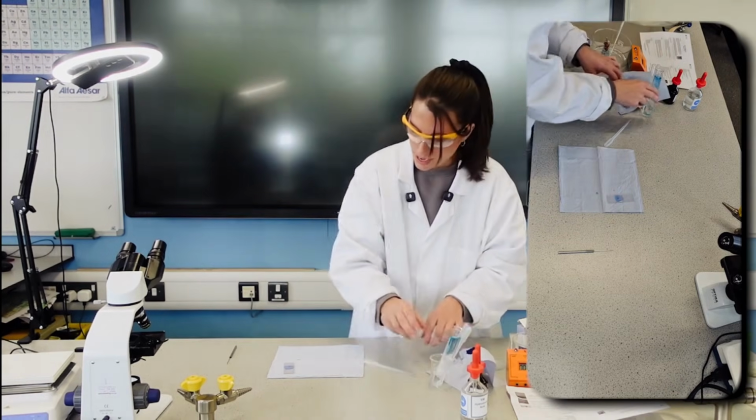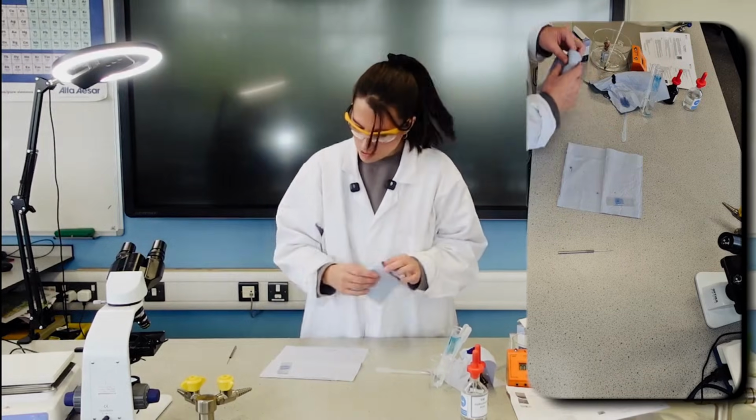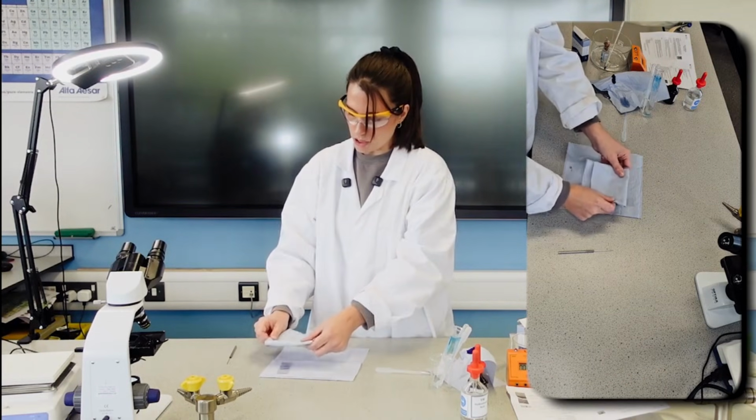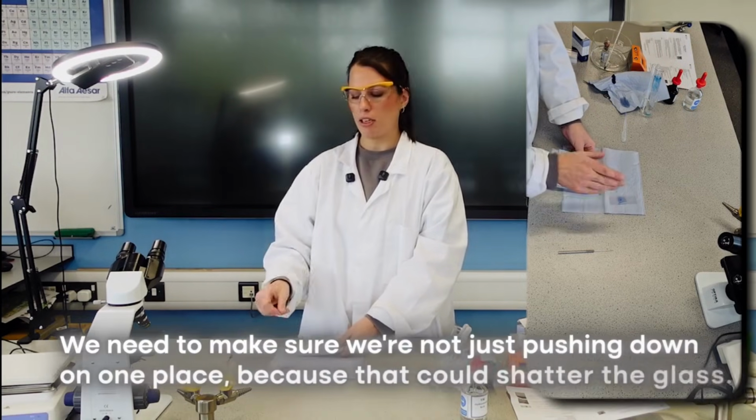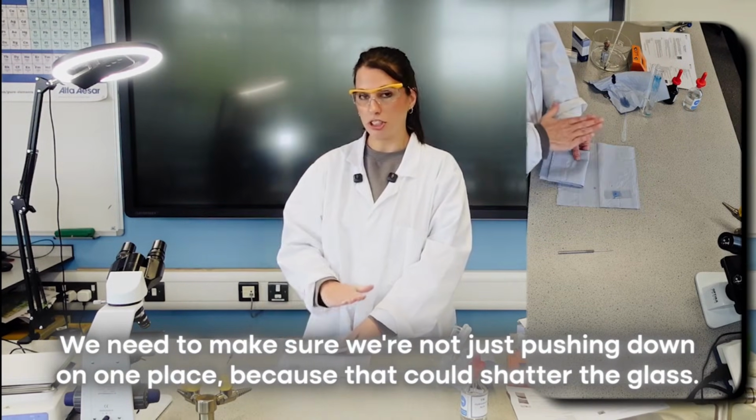And now this is where we get the squash part. So I'm going to put a piece of tissue paper on top, and we need to squash so that we do get that single layer of cells, but we need to make sure we're not just pushing down in one place because that could shatter the glass.